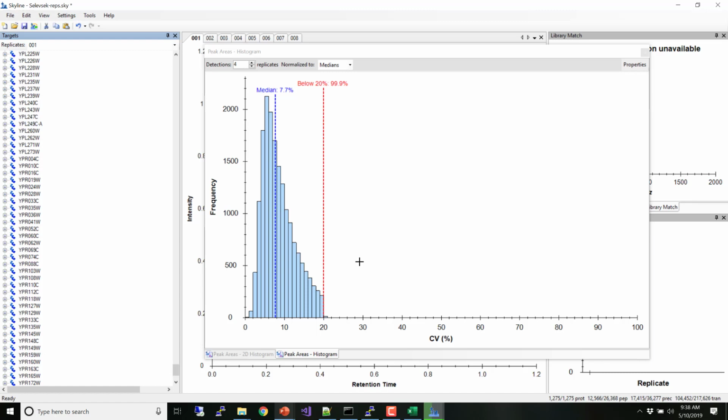Any final questions before lunch? Okay. Come back after lunch, and you'll get to look at the reports that get exported out of Skyline for these data. All right, thanks.